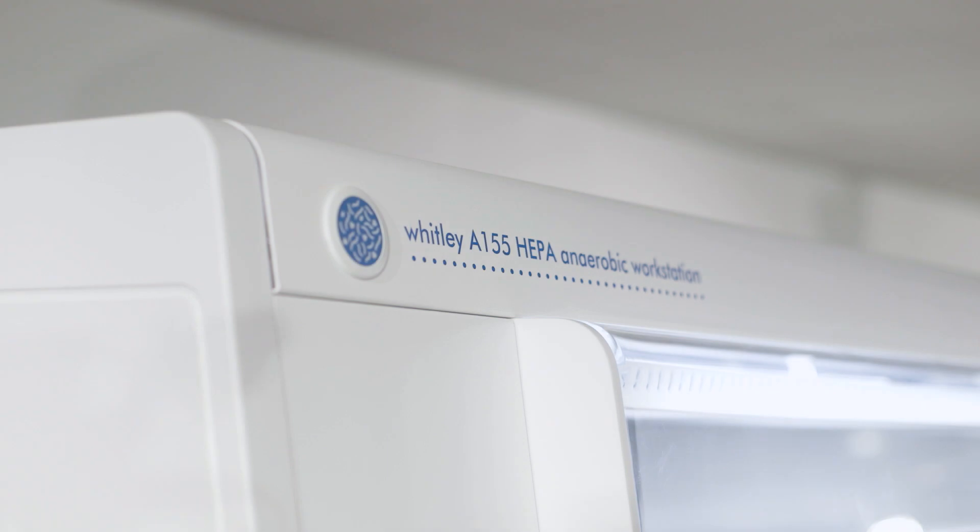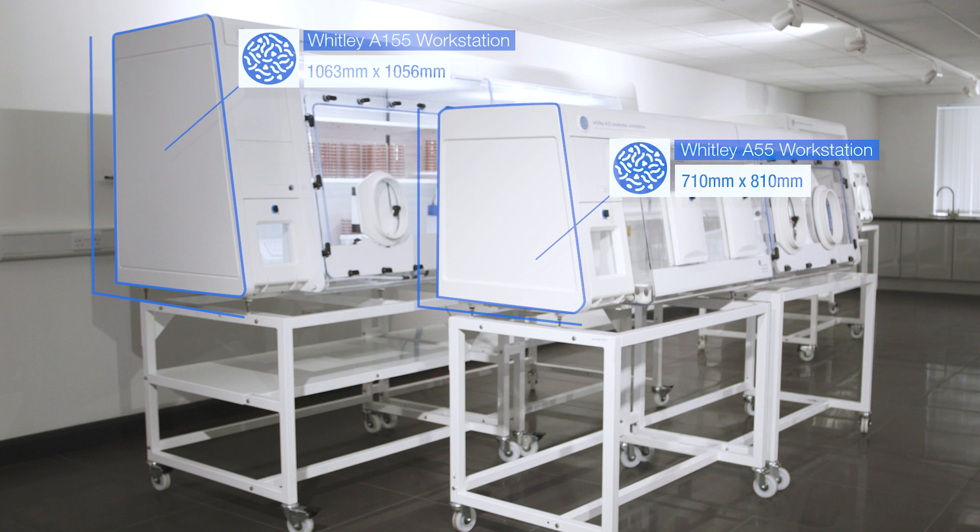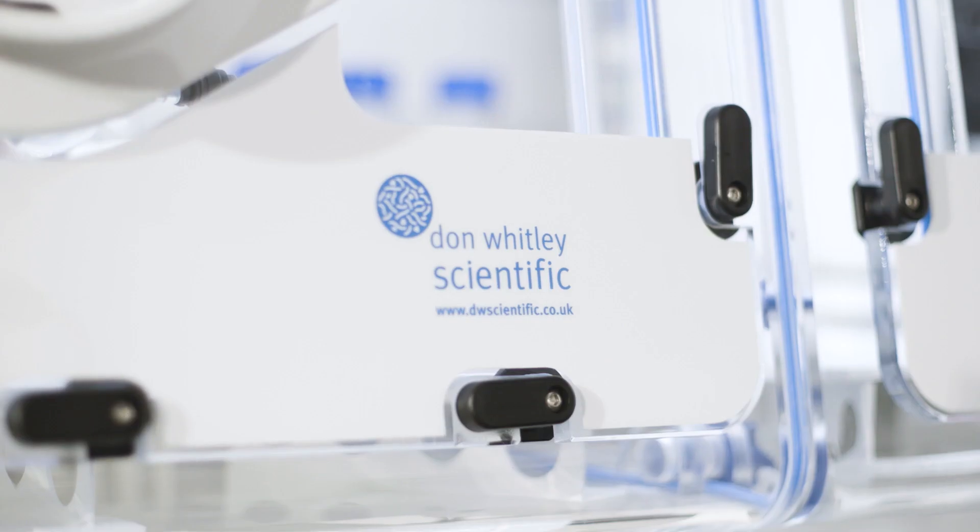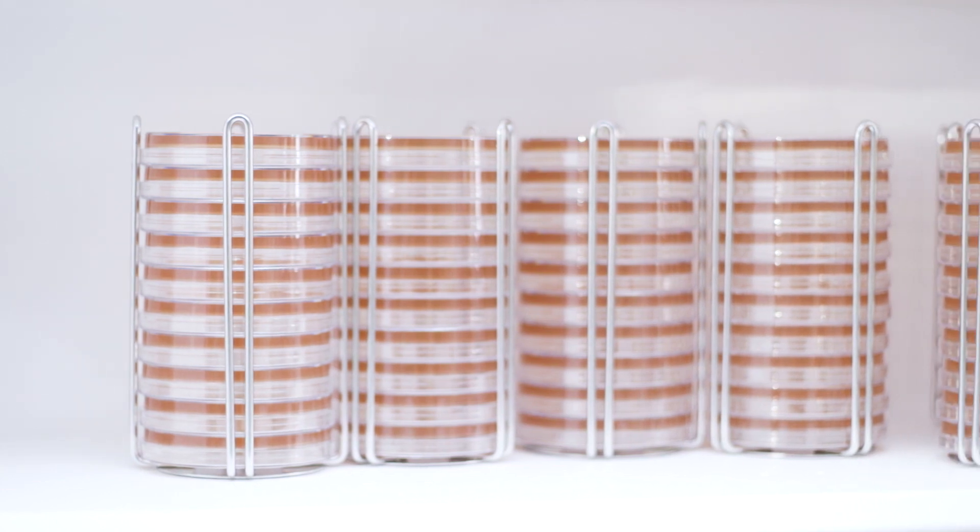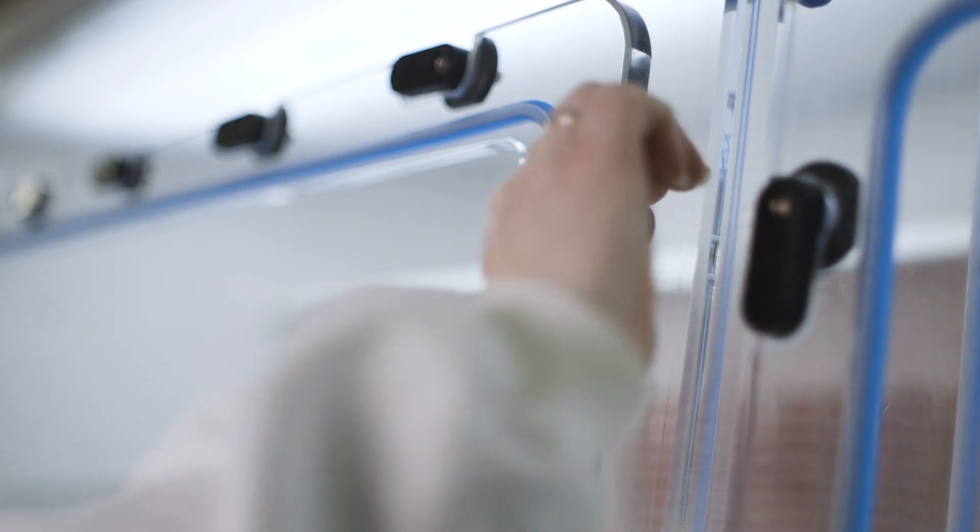The Whitley A155 HEPA workstation is 350mm taller than an A55 workstation. It has a capacity six times that of an A35, two deep airlocks that can be operated independently and two removable fronts.